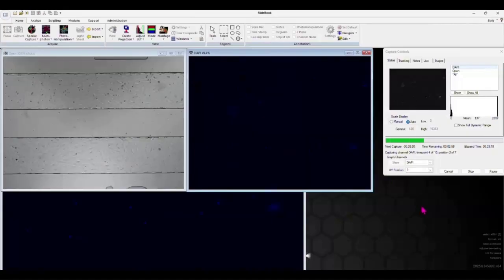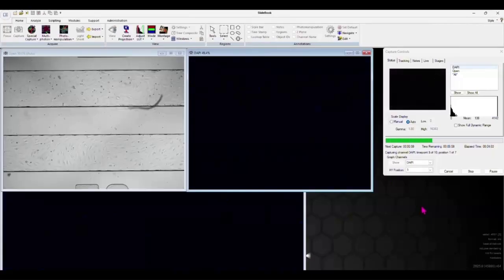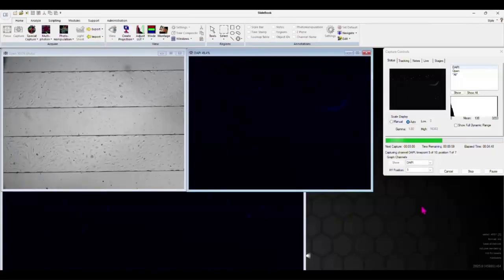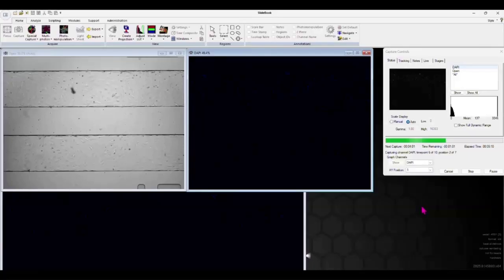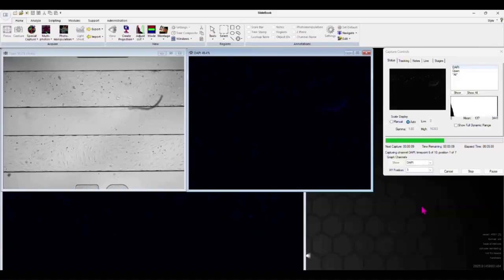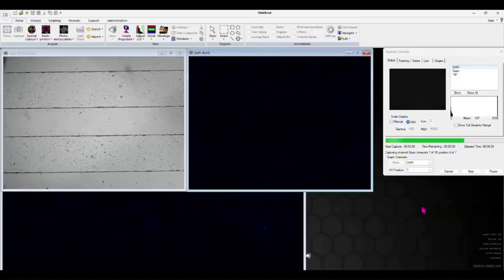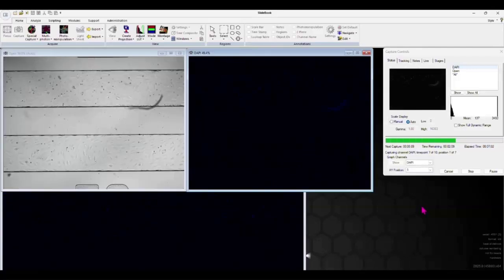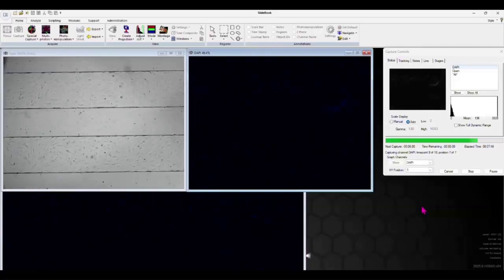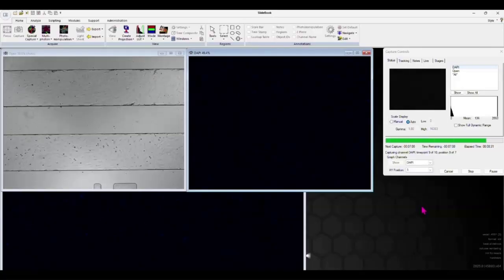After watching several of these captures, you might notice it's easier to see Jurkat cell adhesion in the bright field channel compared to DAPI. That's because live preview isn't available for each capture point during multi-point acquisition, but we'll be able to review the full dataset once the run is complete. So we'll give Montage Plus a few more seconds to finish up image capture, and then we'll begin data analysis.